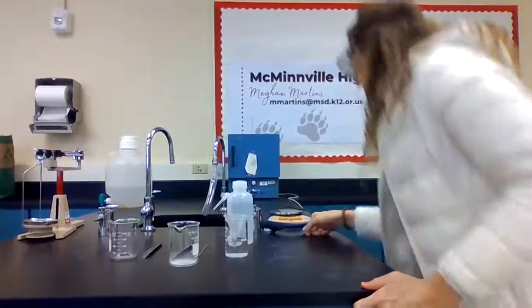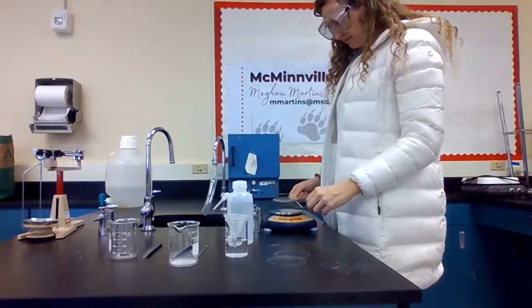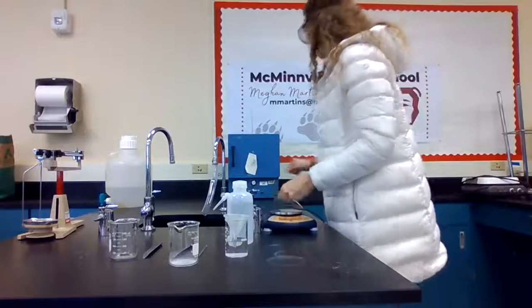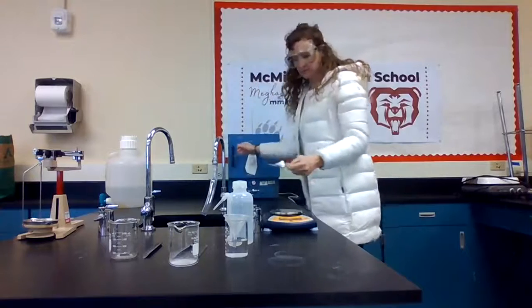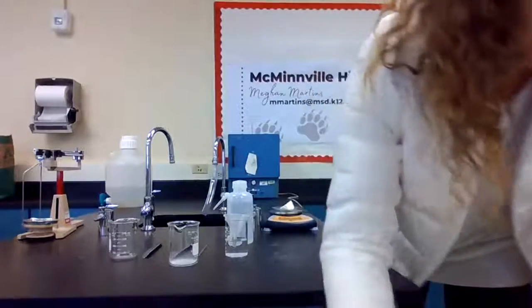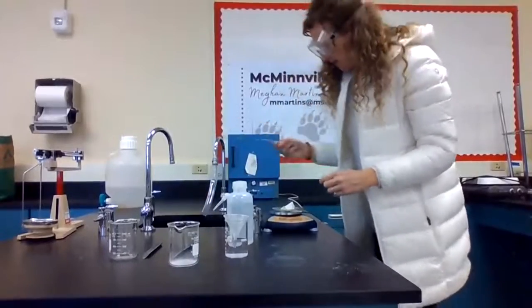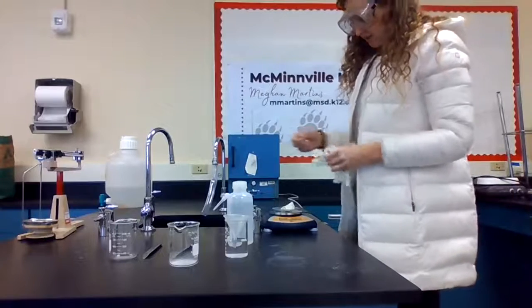All right, and check number 4. .9 grams. Let's also take this opportunity to look for some chunks that may need smashing.